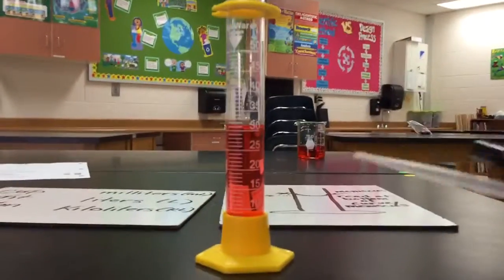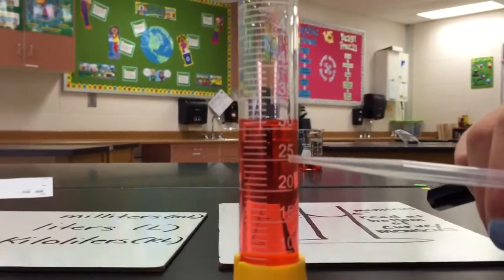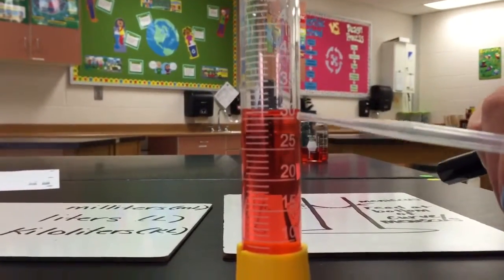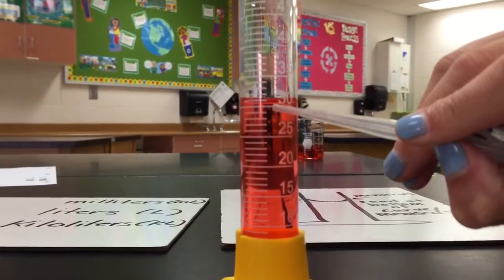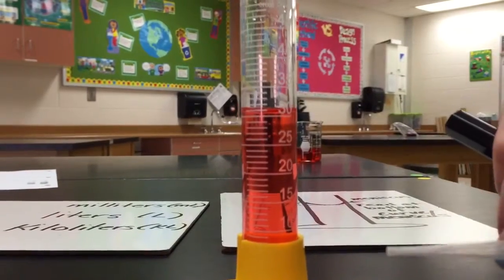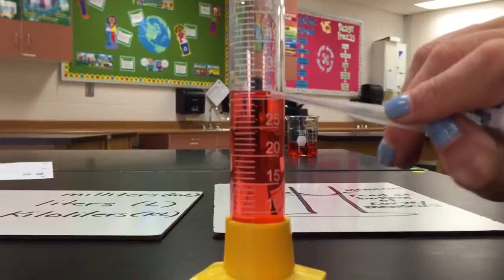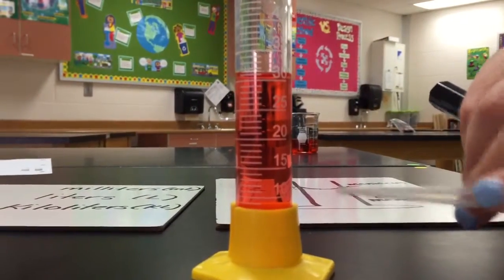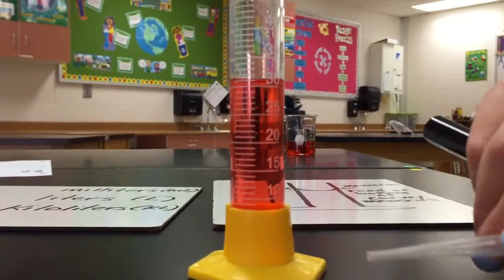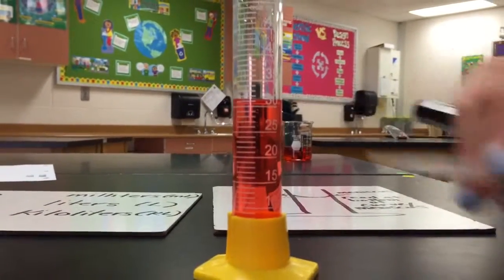So if we look, we have those markings again like last time: 10, 15, 20, 25, and then 30. If I look — 30, then 31 — it seems that you can see that curve. It looks to be right in the middle between 30 and 31, so we would probably call that 30.5 milliliters. So there is your answer.